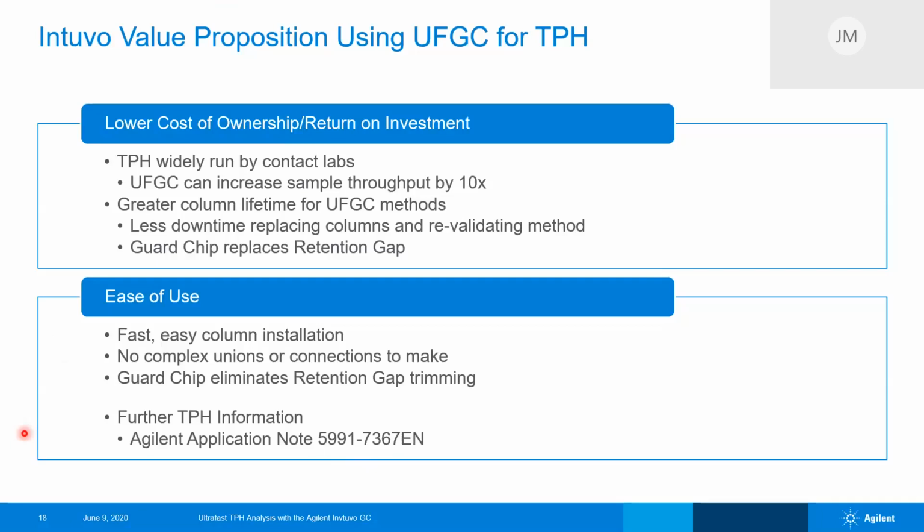In this case, I was using, for this analysis, the oven track mode, so it stayed at its high temperature for a relatively short period of time. And that worked perfectly well for this analysis. Some customers think that, or will suspect that hotter is better, and that's not always necessarily the case. So you want to make sure that you don't heat it to too high of a temperature for too long of a period of time.